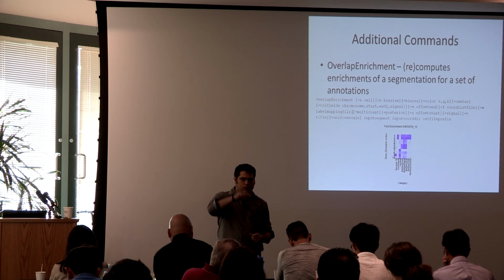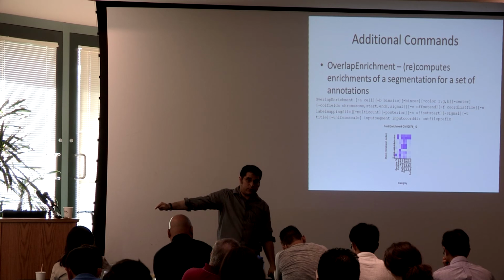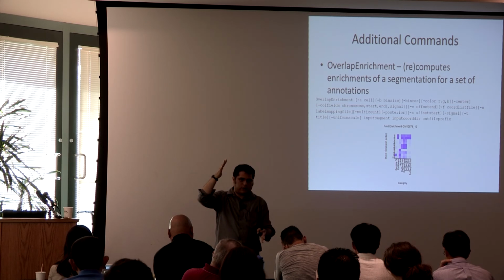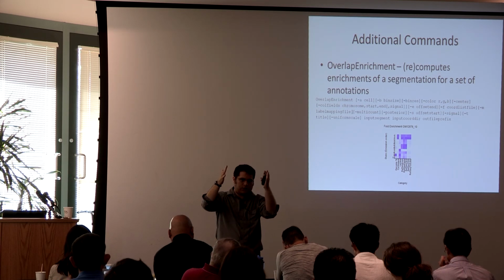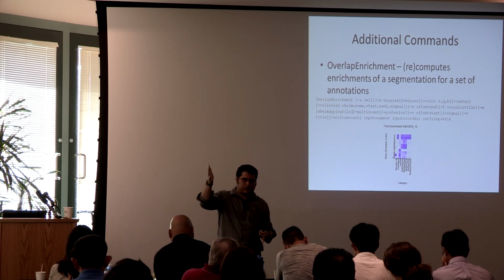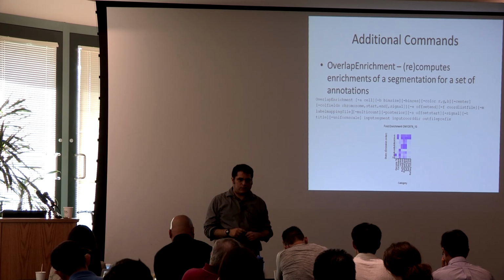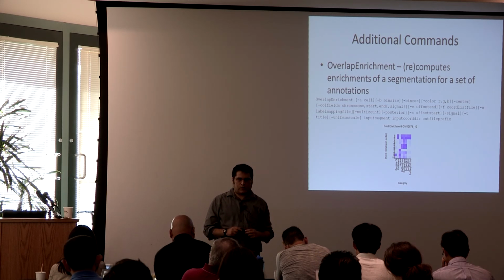The other thing is, if you have some distal regulatory element, you want to know what genes it is potentially regulating. I've done some work, and others have, where you correlate the histone mark or the chromatin states across cell types with the expression. If you see that in a subset of cell types you have the enhancer, and in another set the gene is expressed, that gives you some statistical evidence that there's a connection between this regulatory element and that gene. So that's another way these can be used in the network connection framework as well.